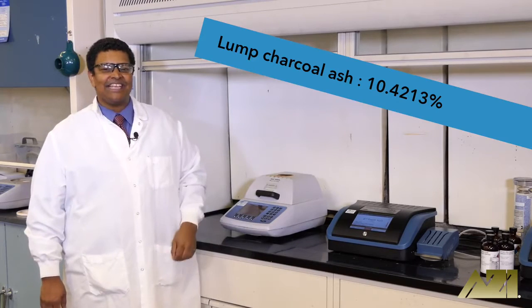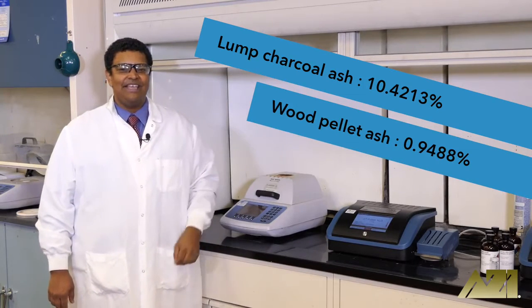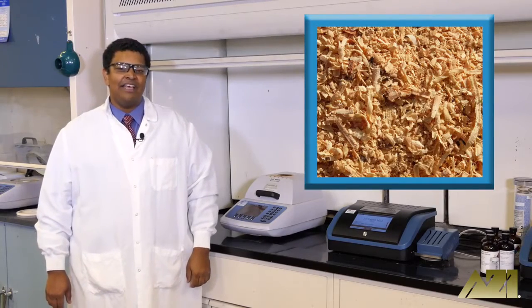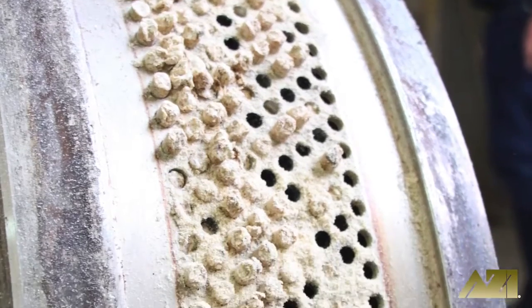The lump charcoal had approximately 10 times the ash content as the wood pellets. This could be because the wood pellets are made entirely of wood that has been ground into sawdust and extruded at a high pressure.